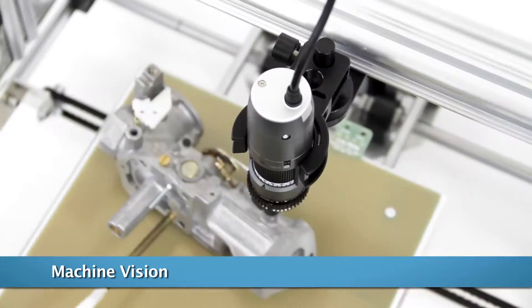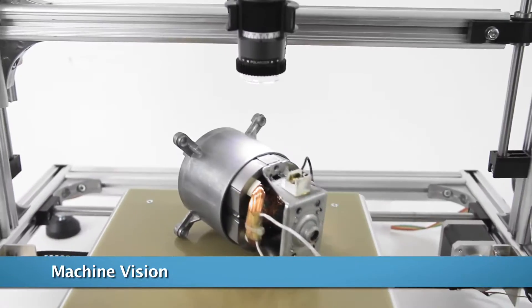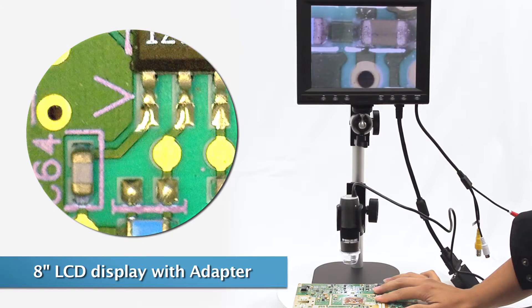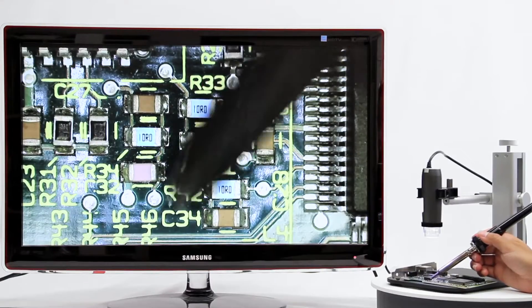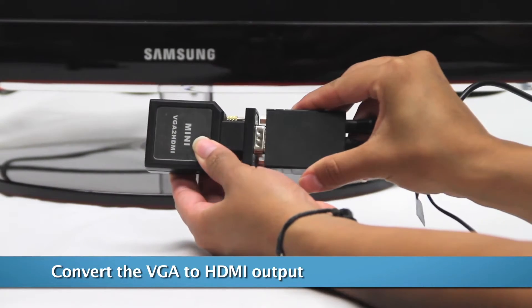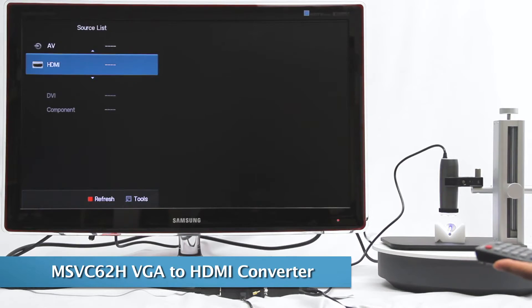These microscopes are great for machine vision inspection for quick live views. These VGA models are recommended for viewing or work that requires the least delay in imaging. There are also VGA to HDMI adapters that allow users to connect these models to TVs or monitors that have HDMI.